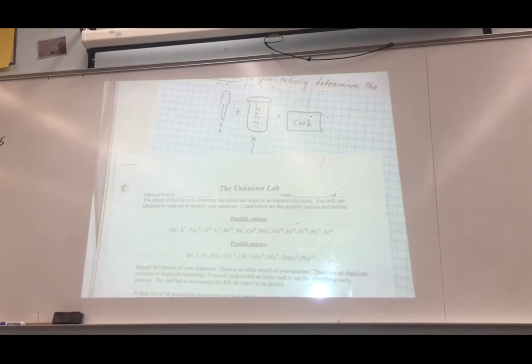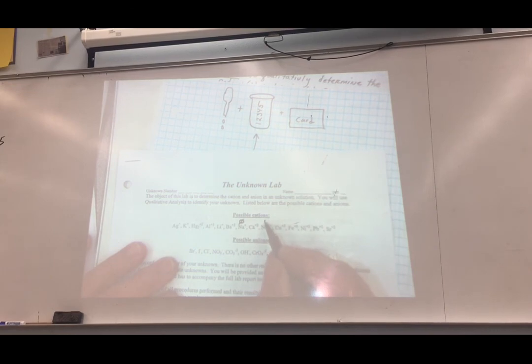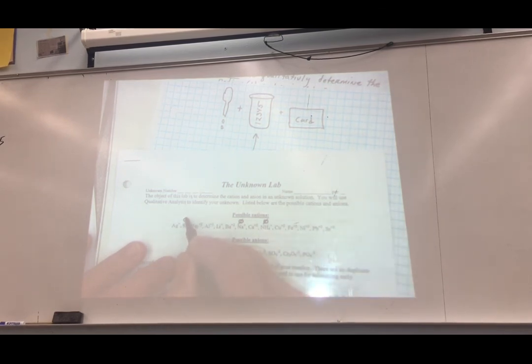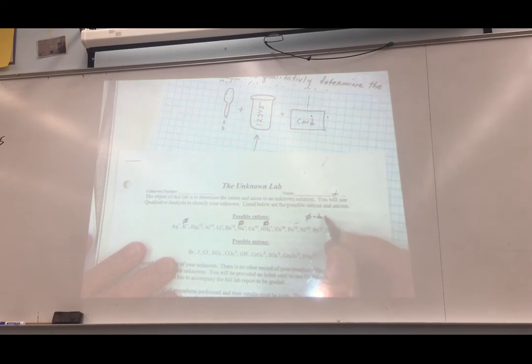Okay? Now I'm going to give you a very important piece of information right now. Sodium, ammonium and potassium do not react in the precipitation test.